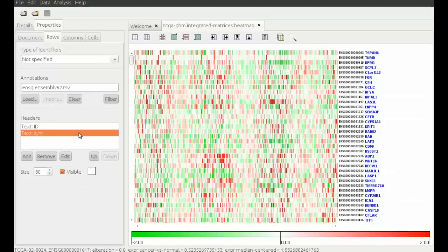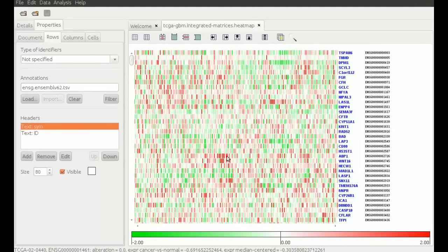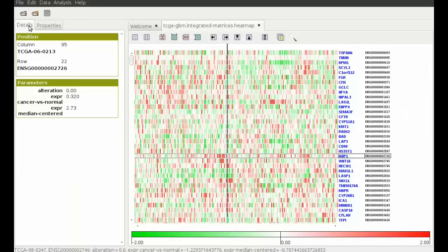Now that we see our data as we like, we can browse around the different data dimensions.